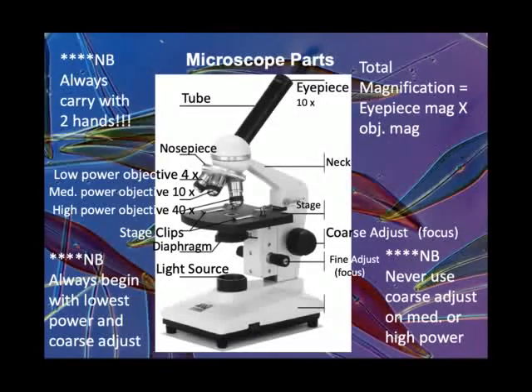Oftentimes people will tell me that the microscope isn't working. I'll look, there's no light source, and then I'll look to see if they have their microscope plugged in, and they don't. So before you come and ask for help with your microscope, make sure that it's plugged in.